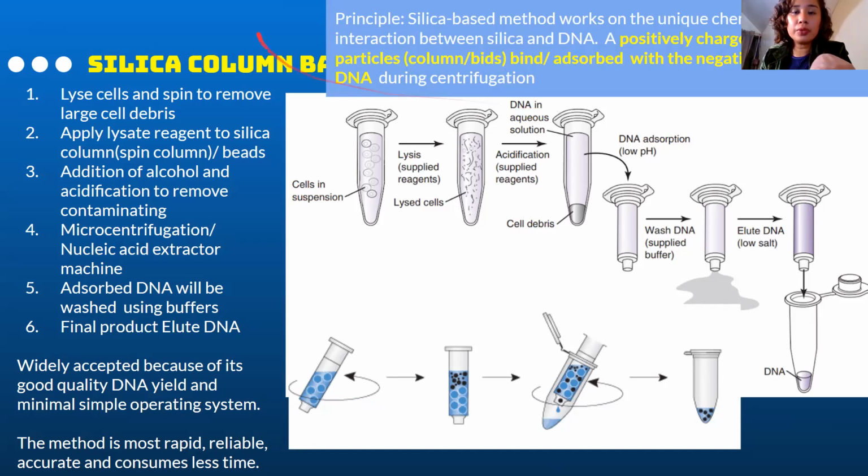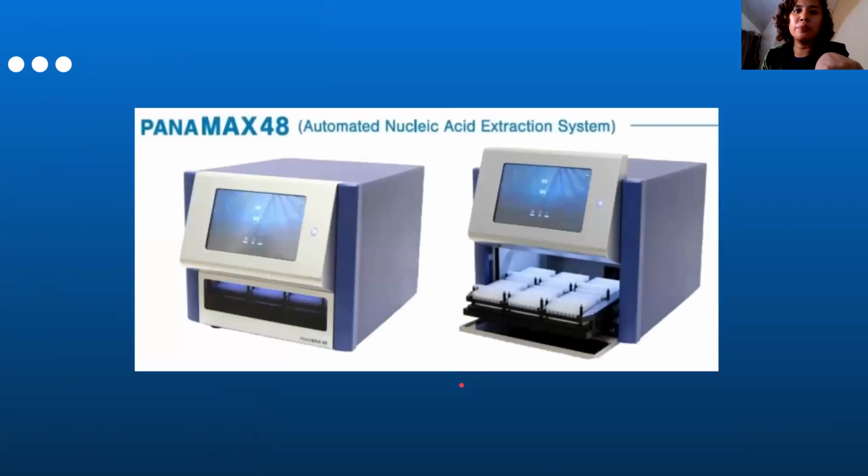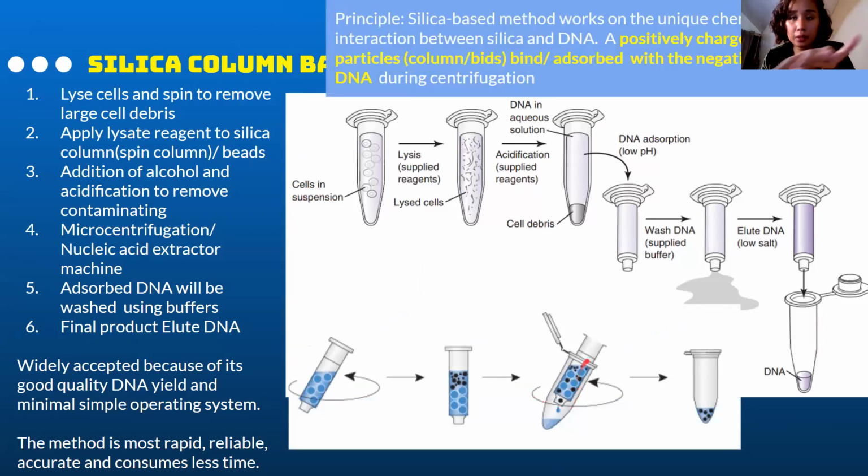So, example, itong malaking beads na to, guys, is your silica. Itong black na representation na to, it's the DNA. Okay? So, your DNA holds on. It is adsorbed by your silica. Ang galing, no? So, first is you lyse your cells and spin, to remove the large debris.